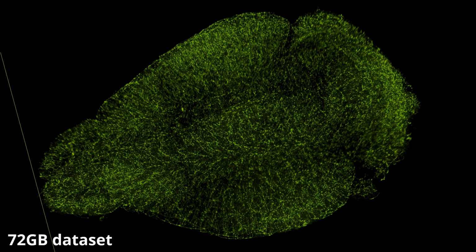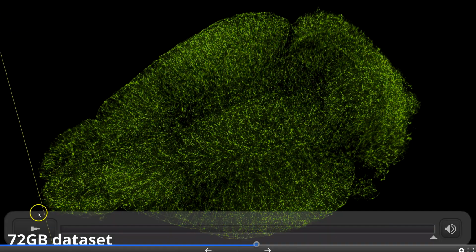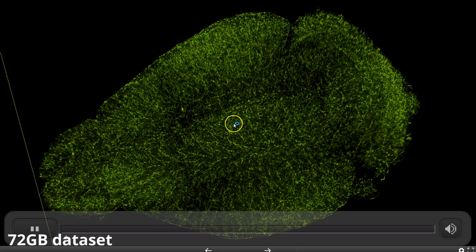And also, I don't know if you saw there, but I'll just run this real quick. We also not only applied a surface, oh, come on. Maybe not. Maybe that was it. You're not going to get to see it again.